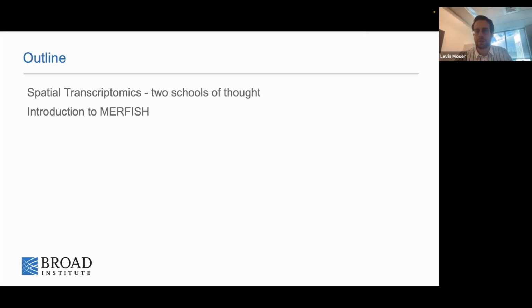I'm just going to give you a brief overview to make sure that we are all on the same page. I'm going to talk a little bit about data processing, and then we will start with some programming or some data analysis.